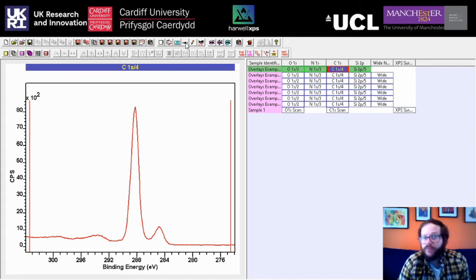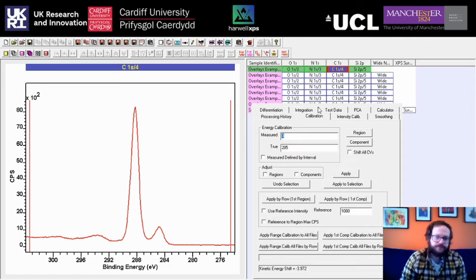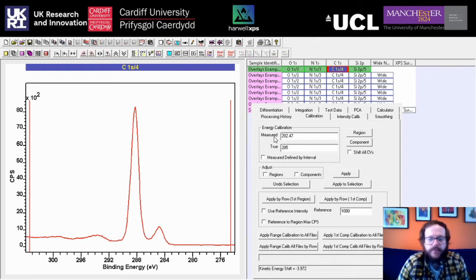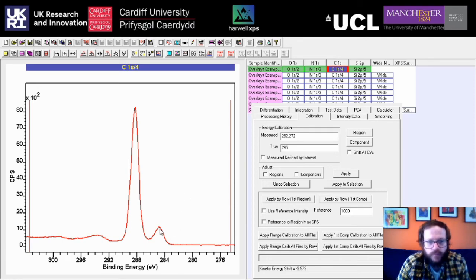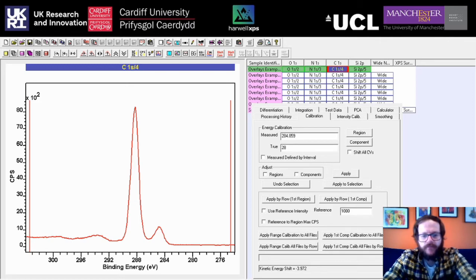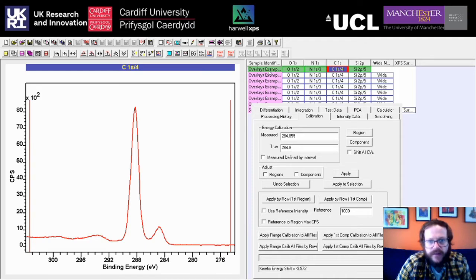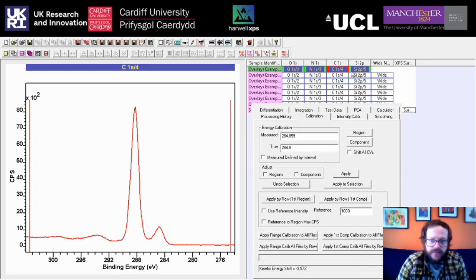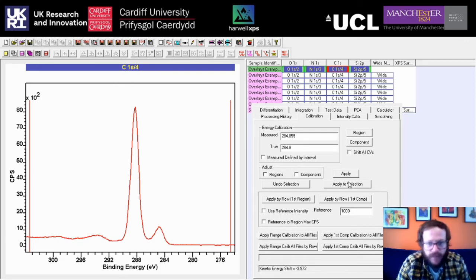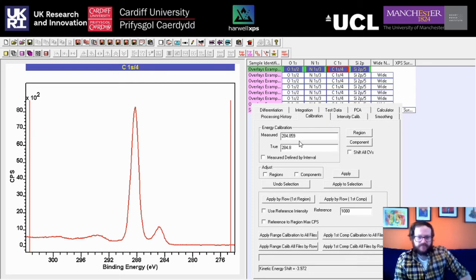To calibrate, go to the Processing tool up here, open it and go to the second tab: Calibration. This opens a box with some options. If you click on the spectrum, you can see the measured value changes depending on where you click. For a sample like this, I would calibrate based on the lowest-energy carbon peak — the C-C/C-H bonds. Click on the peak maximum, change the reference value to 284.8, then click on the sample name to highlight all associated blocks, and use Apply to Selection to apply this calibration factor to all element blocks. I'm not going to do it here because this data is already calibrated to almost exactly 284.8.